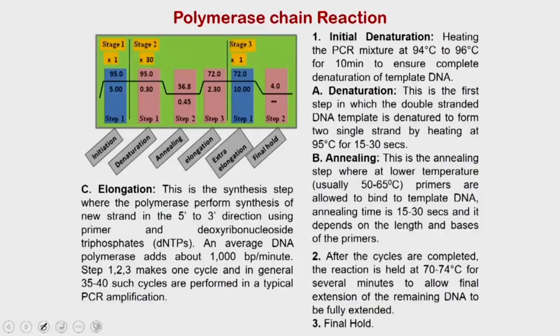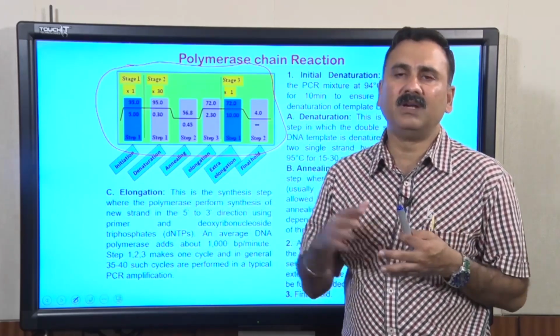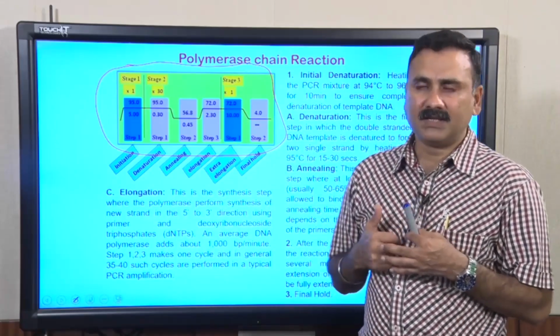Now moving on to the third thing, which is about the PCR reactions. They will let you discuss the PCR reaction, and also how to set up the cycles onto the machine and how to operate them. The machine we have in our laboratory may not be the machine available in your institutions or in your setup, but more or less the steps remain constant, whether it is a machine from one company or another. Only a few buttons may be different, or the way you have to operate these machines may be different, but the overall basic principle remains constant.